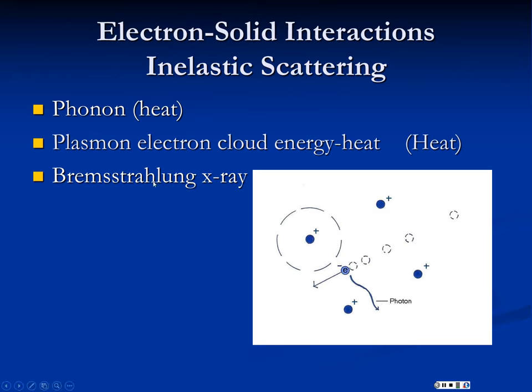And so when electrons hit a solid and slow down, they emit X-rays. Now, the problem with Bremsstrahlung X-rays, besides the fact that they're hazardous because they're X-rays, is that they're emitted at every possible wavelength, every possible energy level. It's just noise. So you get this X-ray noise anytime you shoot an electron beam at something.